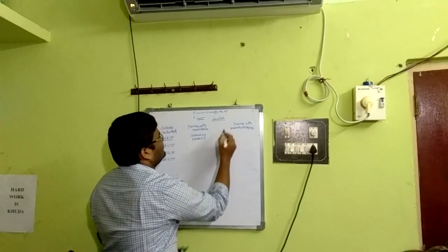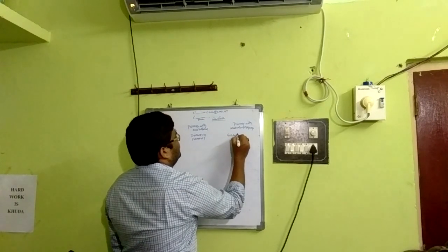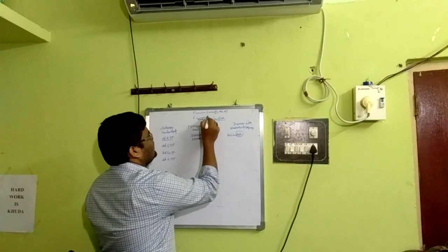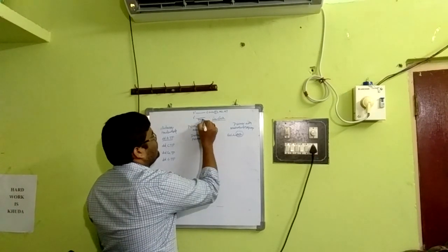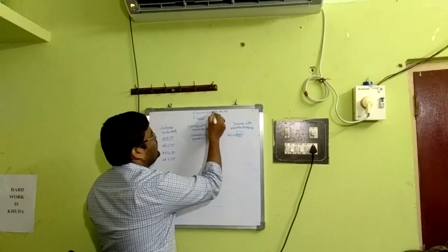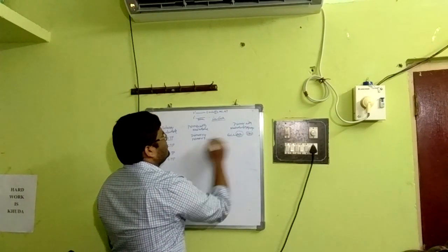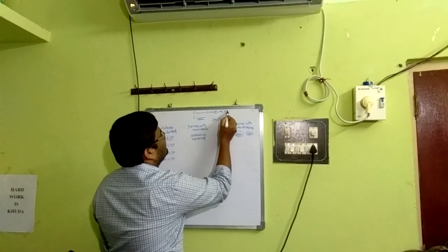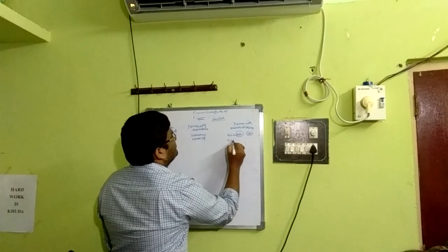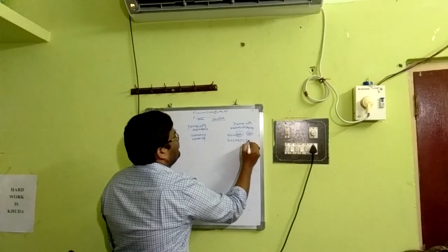The respective sequence will be G, C, C, then ddA. Opposite to T, the complementary, ddA, the chain terminated. The same here also, plus 9, another T will come here. That means the sequence will be G, C, C, A, G, T, C, T, then ddA.